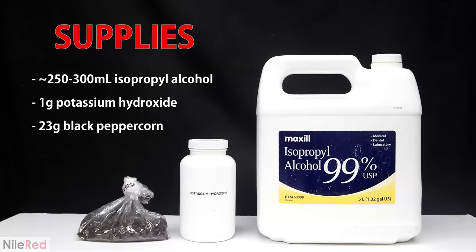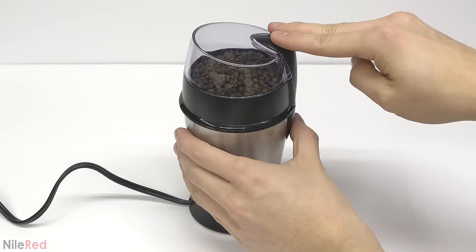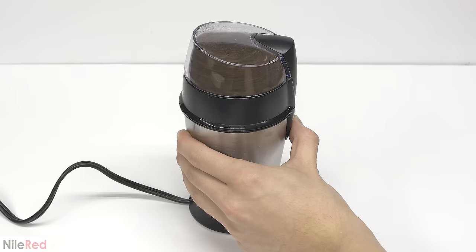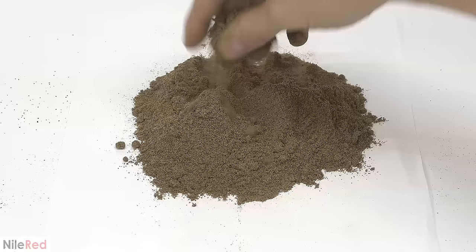In terms of supplies, I just needed three things: the pepper itself, potassium hydroxide and isopropyl alcohol. Both the potassium hydroxide and the isopropyl alcohol are food grade. The first thing that I need to do is crush the pepper, so I use a coffee grinder. It's important not to crush it too much though because if the powder is too fine, the Soxhlet extractor isn't going to drain properly.